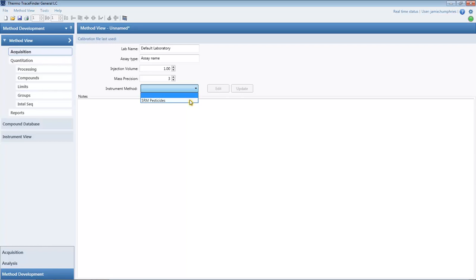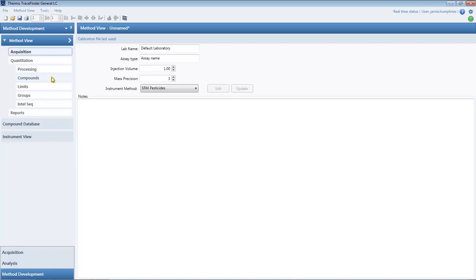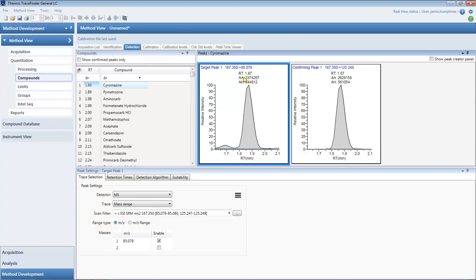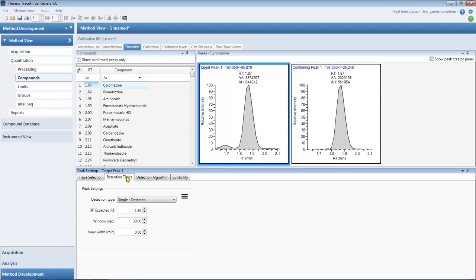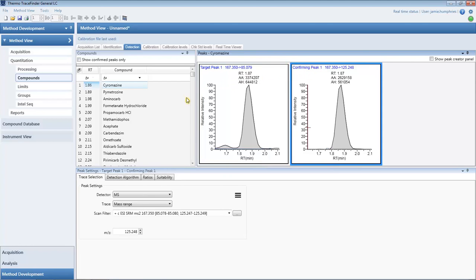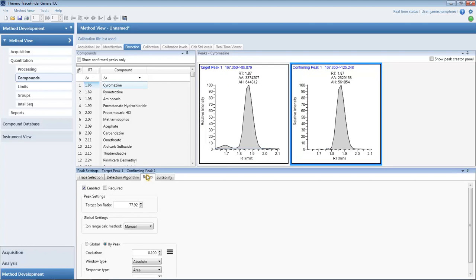The auto-filled processing parameters are in the compounds tab. We can check the compound information provided by the compound database. The peak shape, retention time, and confirming ion ratios are imported from the raw file.